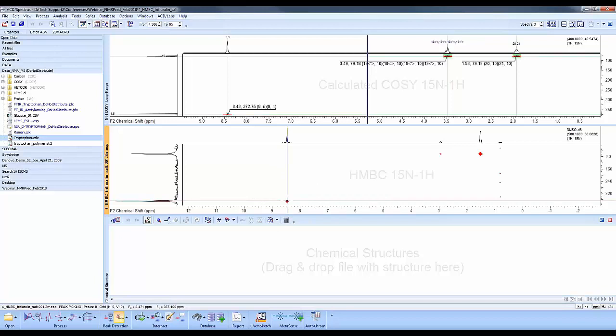In using the calculated HMBC, we can determine our spectral widths prior to collecting the NMR. That saves us time and reduces time wasted on the instrument.